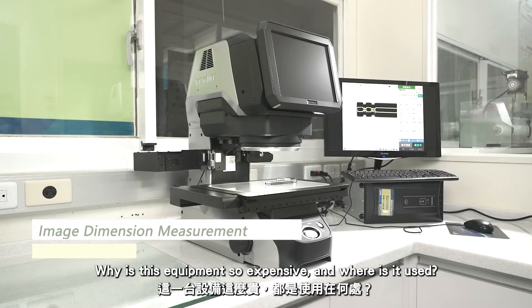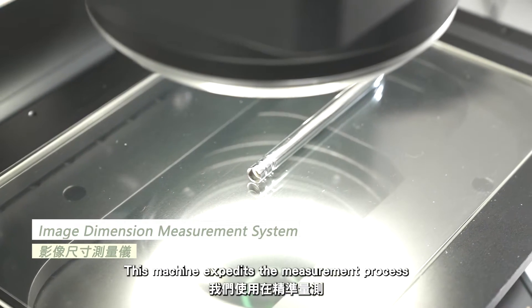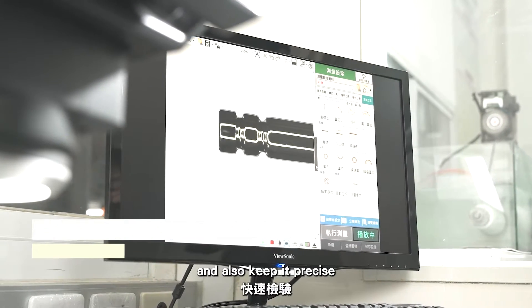Why is this equipment so expensive and where is it used? This machine expedites the measurement process and also keeps it precise.